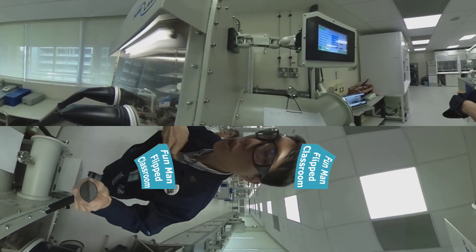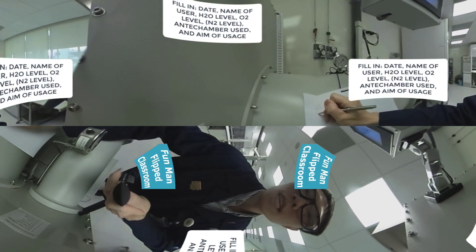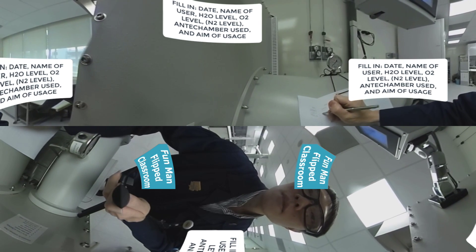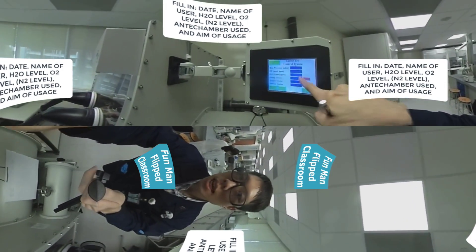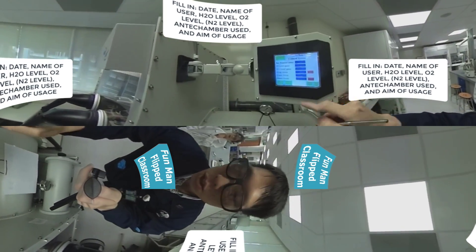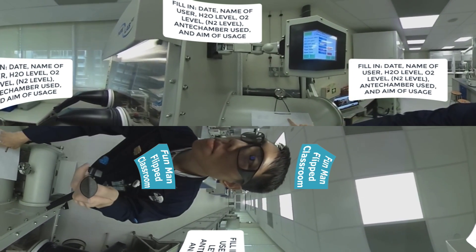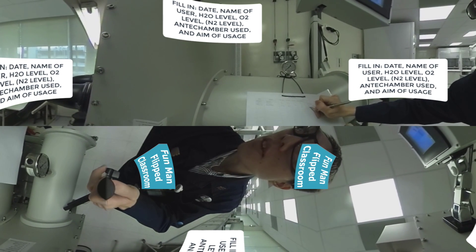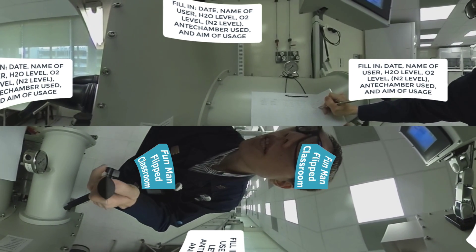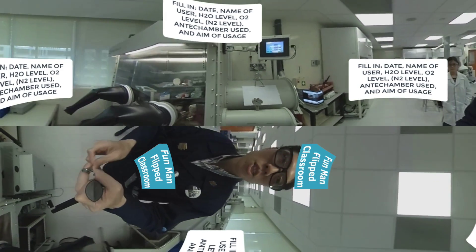Before using this glove box always check the control system, write the numbers and fill them in. Today is 28 June 2017. H2O level: zero — wonderful. O2 level: 0.1. Nitrogen level — okay. So we'll be using this small anti-chamber. Remark: this is a demonstration of the glove box with a 360-degree camera.